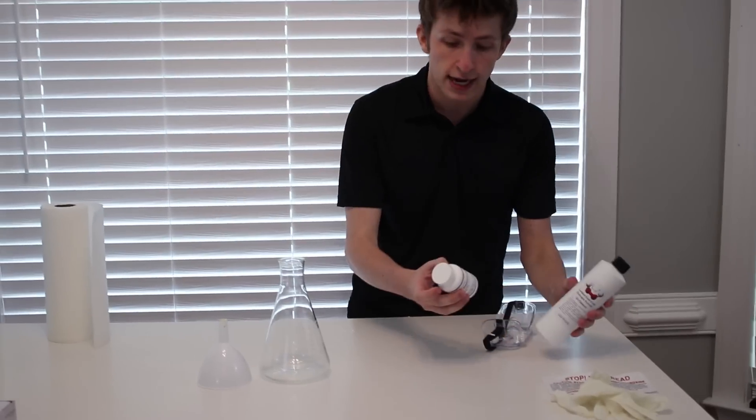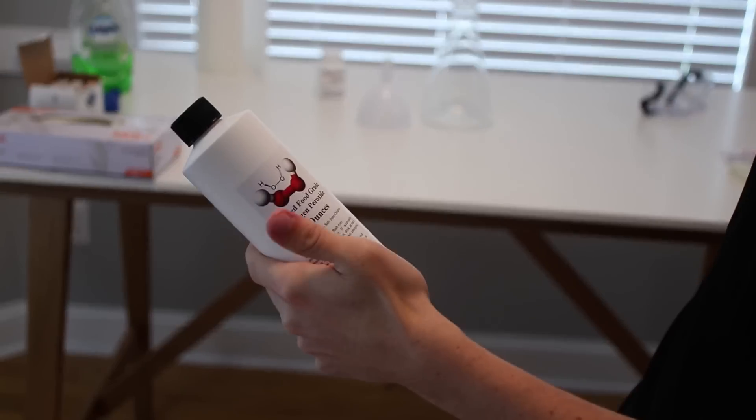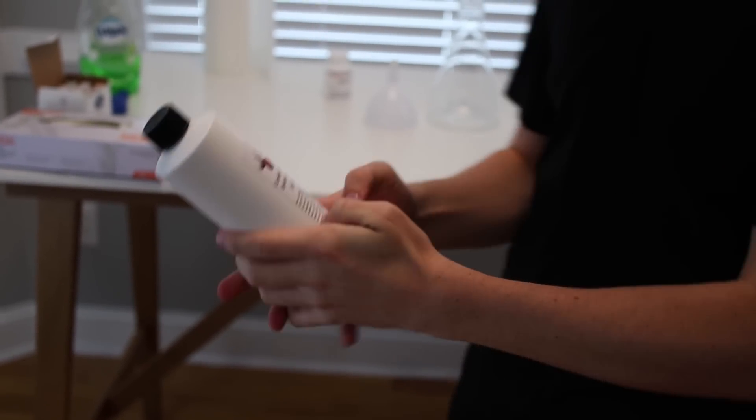Now if you guys know what this is, you're excited. If you don't, let me explain to you what's supposed to happen and what we're going to be using here. We're going to have this vial right here and we're going to be using the two main ingredients, which is potassium iodide and hydrogen peroxide. What we have here is hydrogen peroxide.